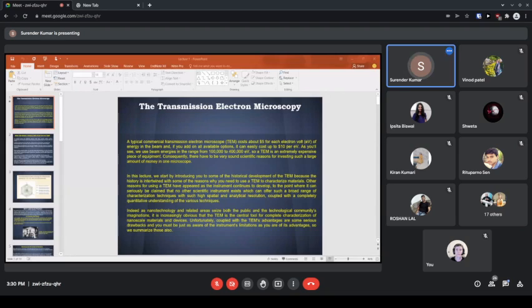So you have to confine them and accelerate them towards your sample. Then you have some arrangement like an optical microscope, with lenses, but here you have electromagnetic lenses because the electron is a negatively charged particle. So that is a different kind of arrangement.